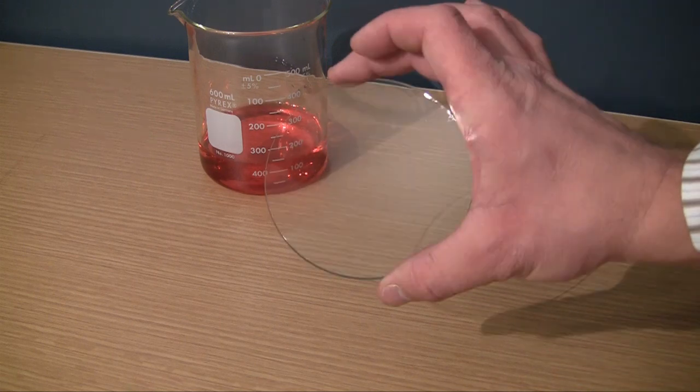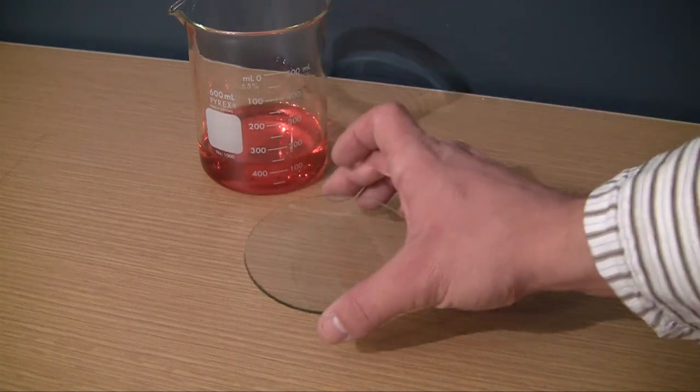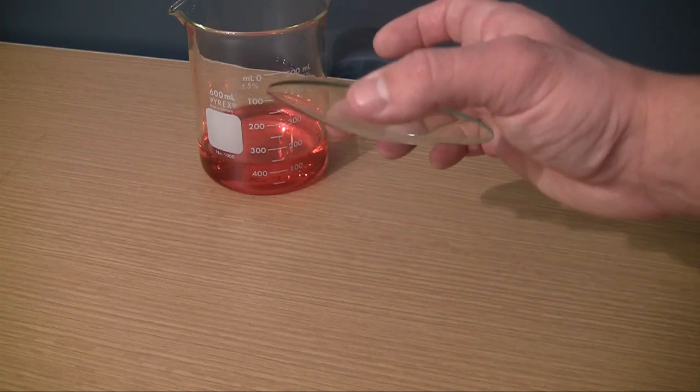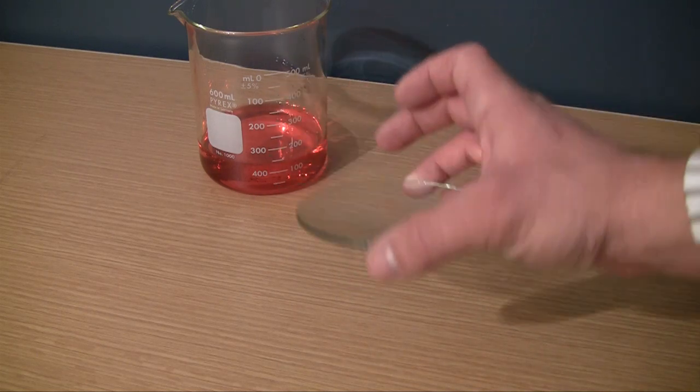Another thing I want to recommend is that if you can, buy a watch glass. A watch glass is basically a big round piece of glass. It kind of looks like a contact lens if you can see it.